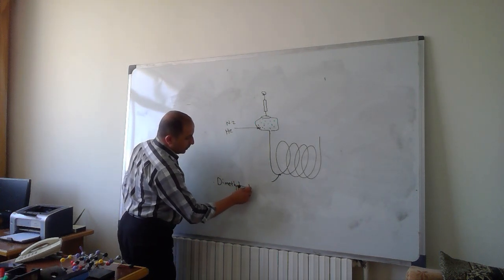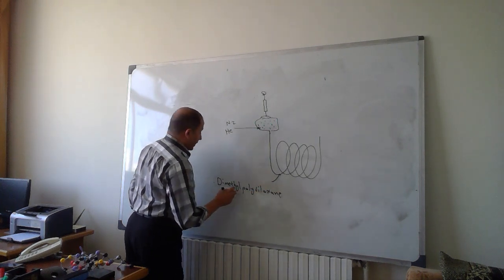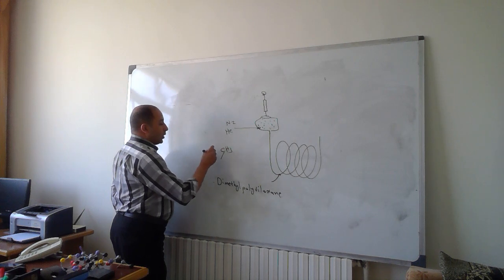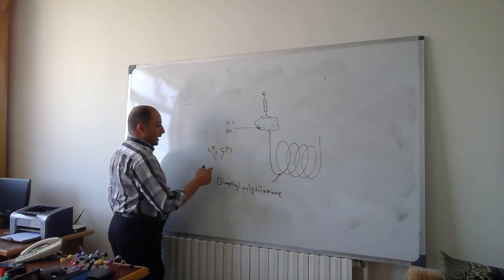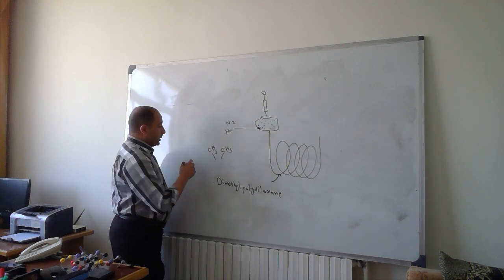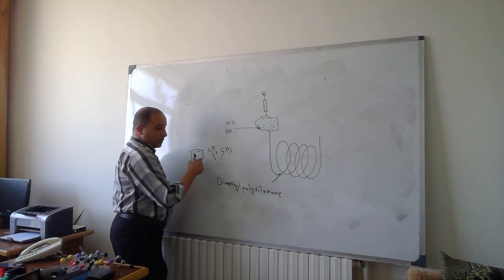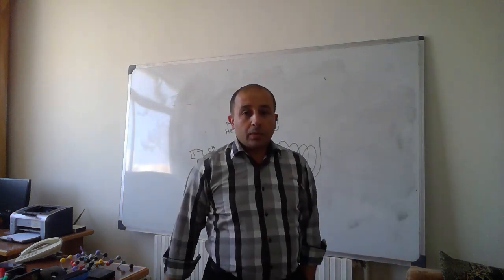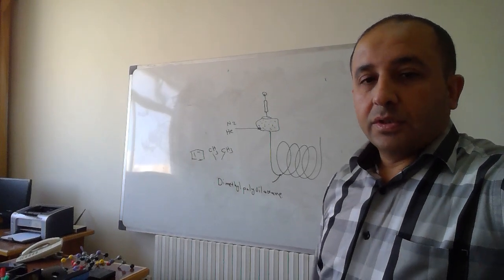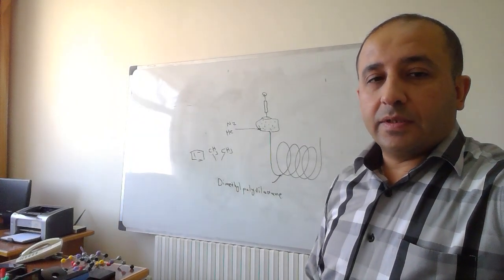Dimethyl polysiloxane is simply silica containing methyl groups, or sometimes we have these columns with 1 or 5% phenyl groups. They have methyl groups, but with some portions of phenyl, such as OV1. OV1 means it contains 1% phenyl.